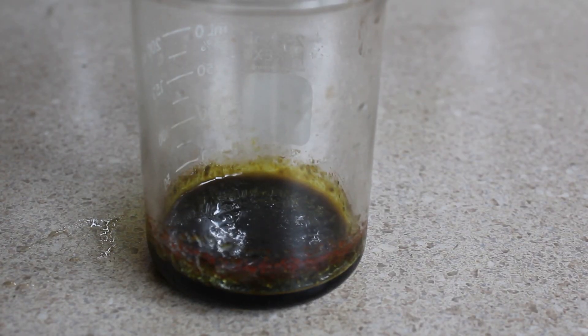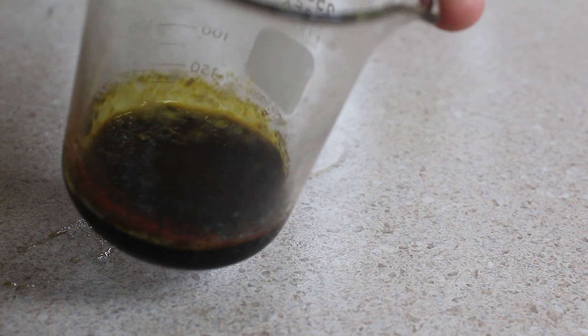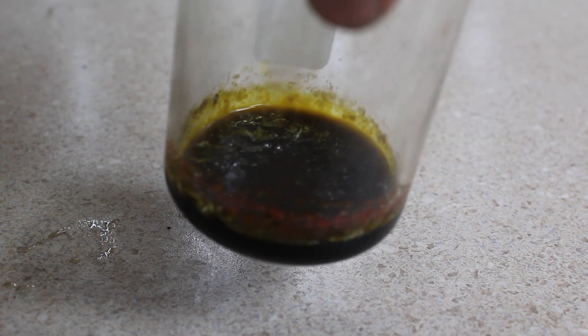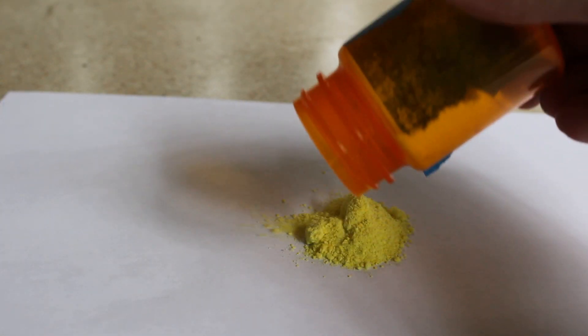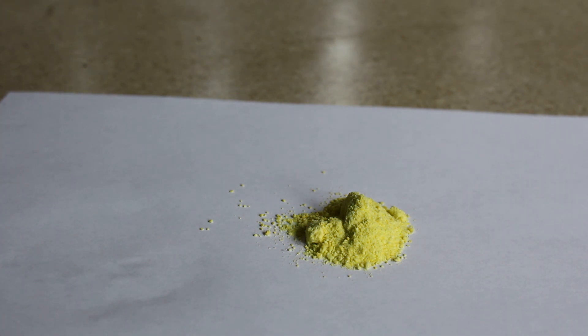I was unable to get the last little bit of water out of the dichromate sludge so I set it out to slowly evaporate over time. The small red crystals that you see on the side is the sodium dichromate. I boiled down the rest of the normal sodium chromate solution and I was able to obtain the salt right away.